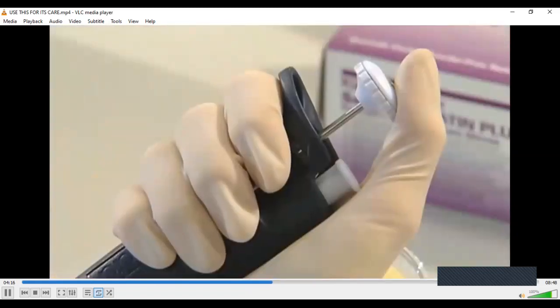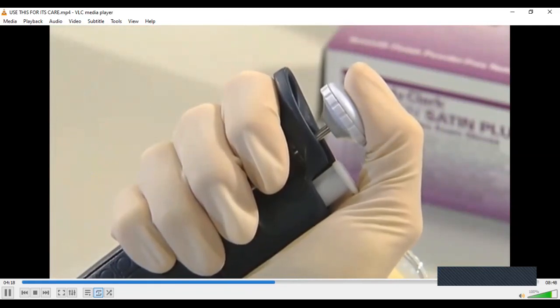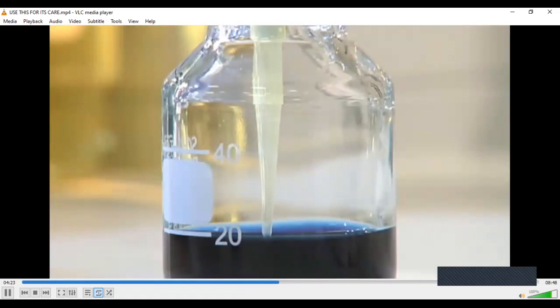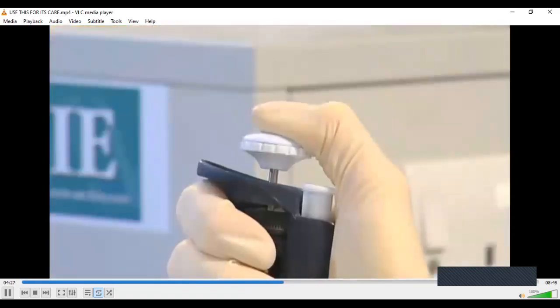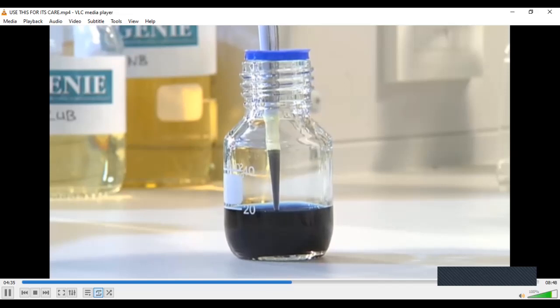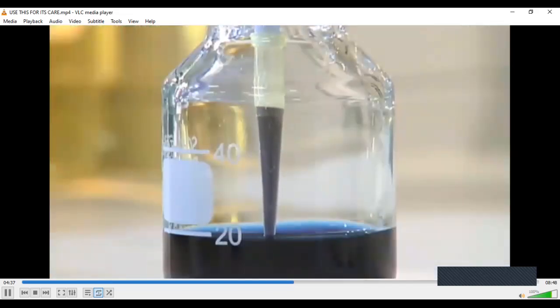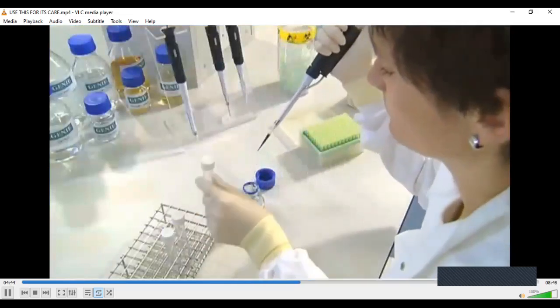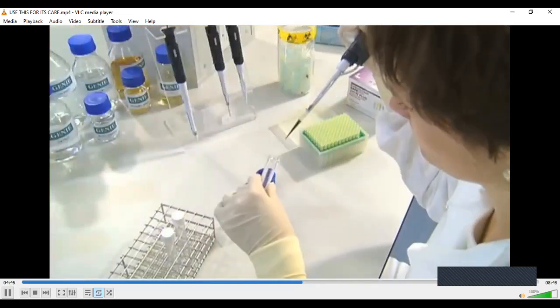So to use the pipette, push the button down to the first stop. Then, keeping the push button at this level, place the pipette tip about 2 millimeters into the liquid you wish to draw up. Release the push button by slowly allowing it to return to its original position. Pause for a second to make sure all the required volume of liquid has been taken up into the tip. This is especially important when using more viscous liquids, which take longer to draw up. Withdraw the pipette tip from the liquid and place it inside the recipient container.